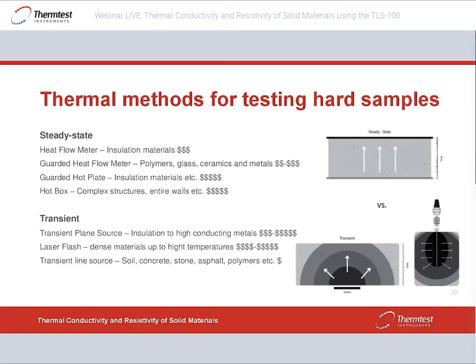So something about a few other methods for thermoconductivity testing, because there are many ways to test thermoconductivity. Not all of them are suitable for testing hard samples, as we talk about here today with concrete and so on, but there are, of course, many methods that could be applied here. For thermoconductivity testing, we have 2 main types of measurements. We have steady state and we have transient. The steady state methods are traditional methods. You find heat flow meters here, guarded heat flow meters, guarded hot plate, and there's something called a hot box.